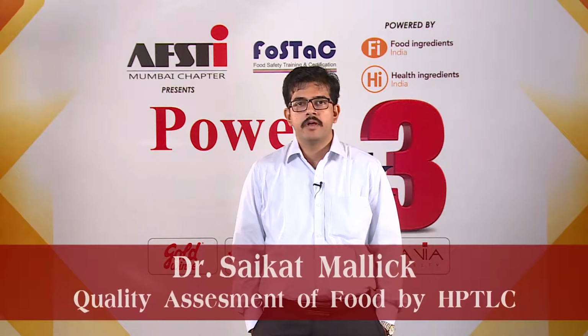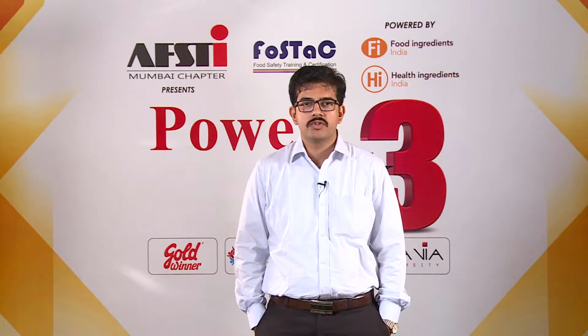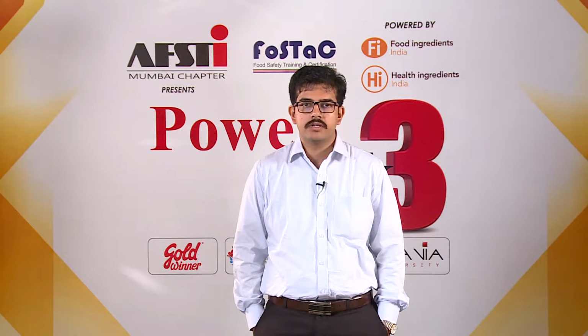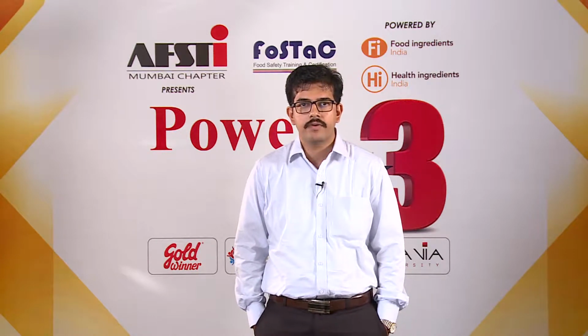Hi, the topic is quality assessment of food with HPTLC. HPTLC is high performance thin layer chromatography, as we all know. Now when we look into the food industry, which is growing rapidly, the expansion is exponential, and with this the challenge is there are three things which are involved in any food.